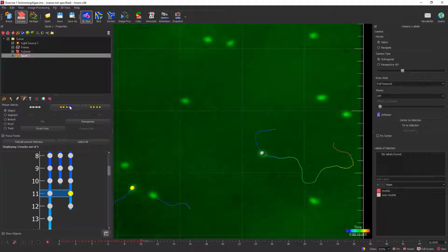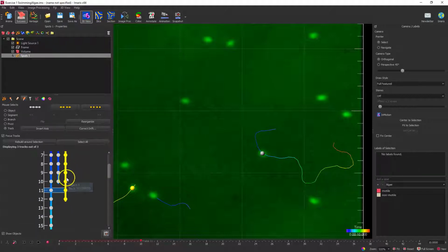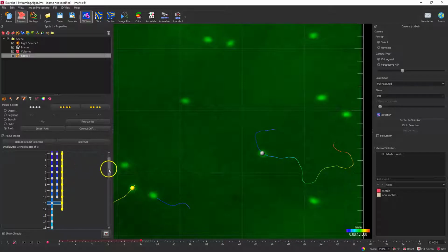And in fact, I'm just going to break this apart again. Even if you have mouse selects track, you can select multiple track segments, and you can hit the join key. And that makes the entire track join back together again. Now, there is a full disconnect button over here that I caution you to use, because what that'll do is completely break up everything here in the tracked object. Now, I personally don't use that very much unless you're really looking to start from scratch and completely disconnect everything. That's entirely possible. You can click this and it'll disconnect all the objects here. They won't be tracked anymore.